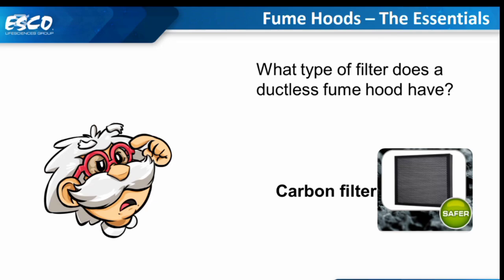This is a quick question, out of curiosity: what type of filters would the ductless fume hood use? We have already covered that. They use carbon filters.